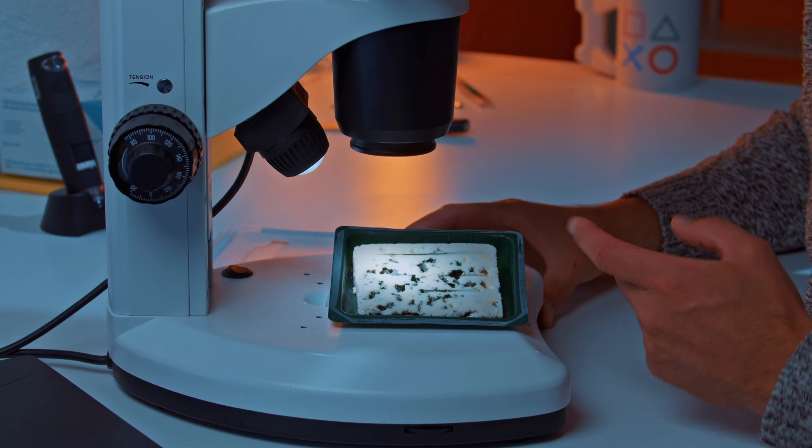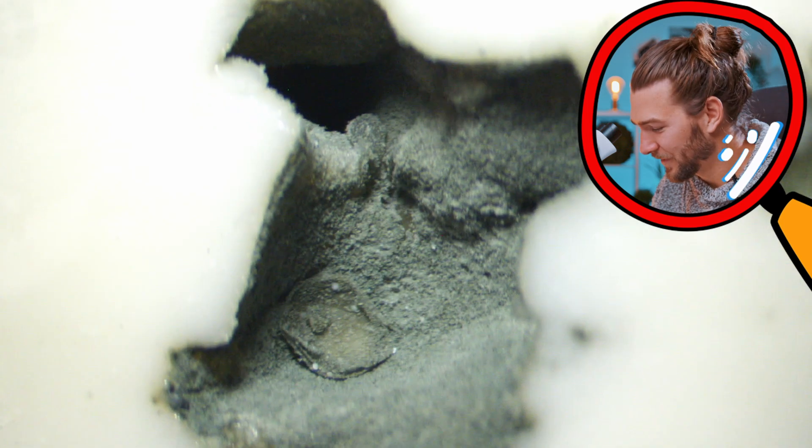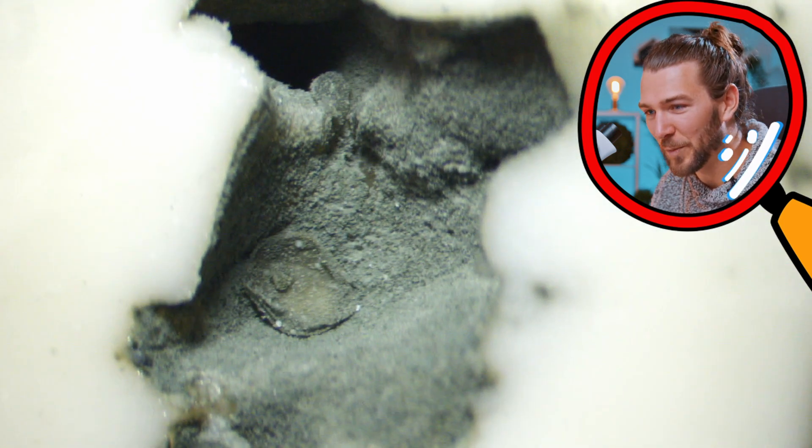There's the very distinctive Roquefort smell here. This Roquefort cheese belongs to the blue mold cheeses. Let's find a good position where we see the mold inside quite clearly. This one has a nice opening here. You can see all the spots, and this mold structure is quite on the surface.